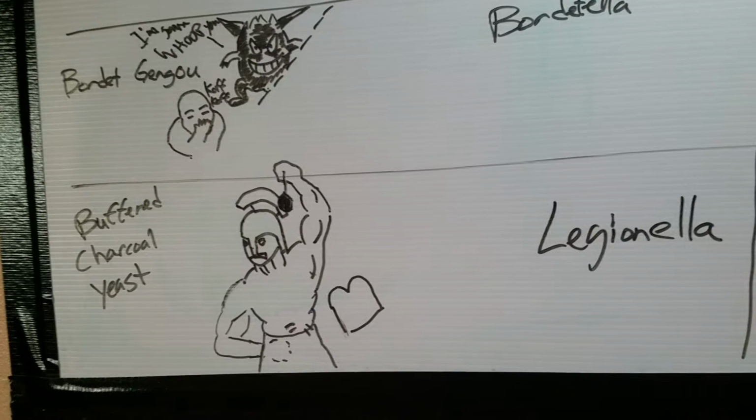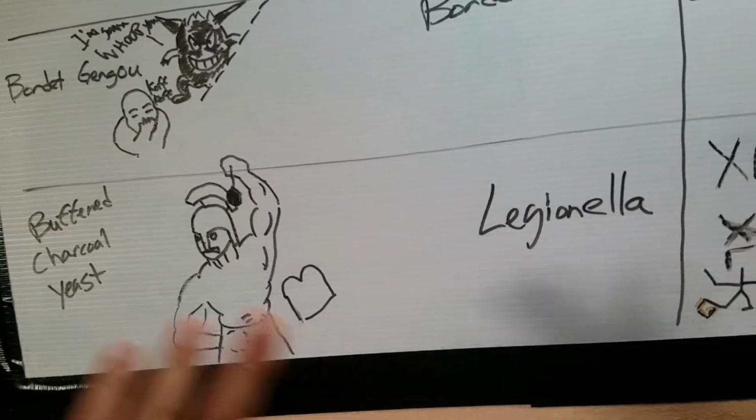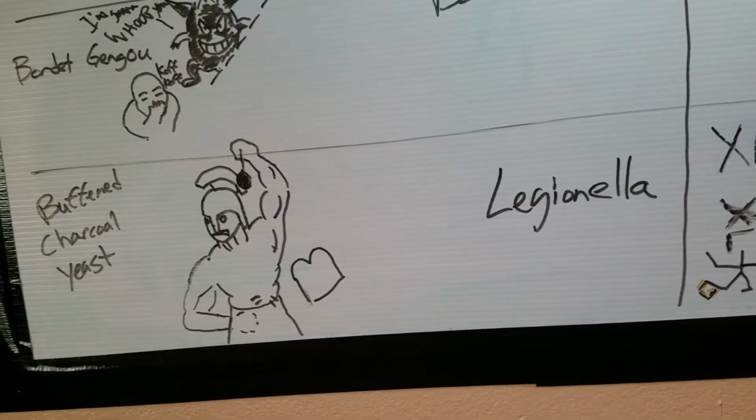got a yeast infection. So, you have Legionella. You remember buffered charcoal yeast. You have buffered charcoal yeast. You remember it's associated with the soldier, aka the Legionnaire or Legionella. All right, let's move right along.